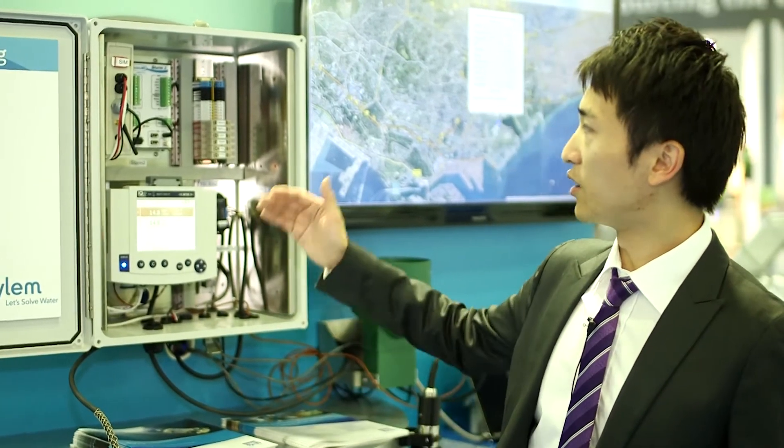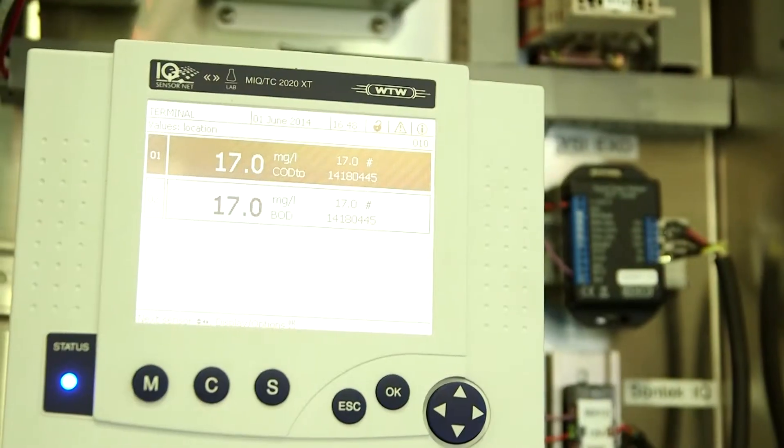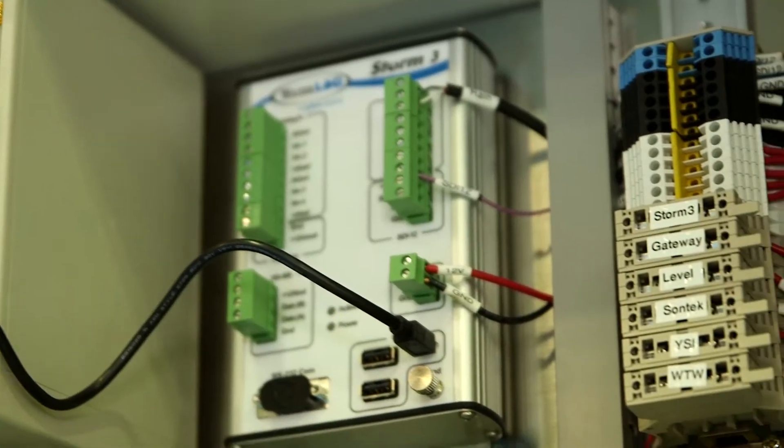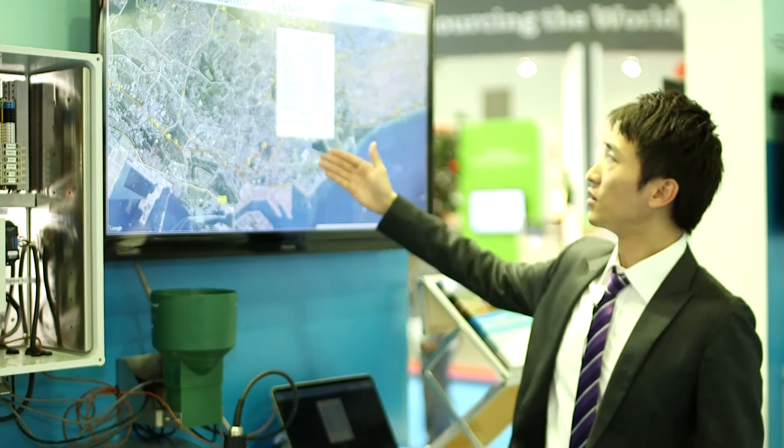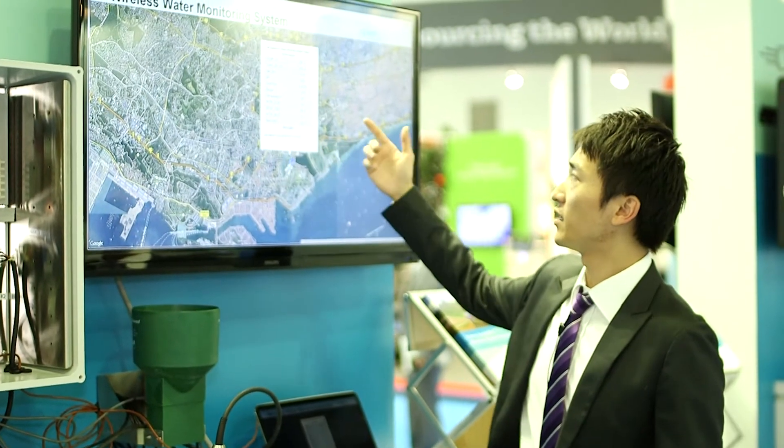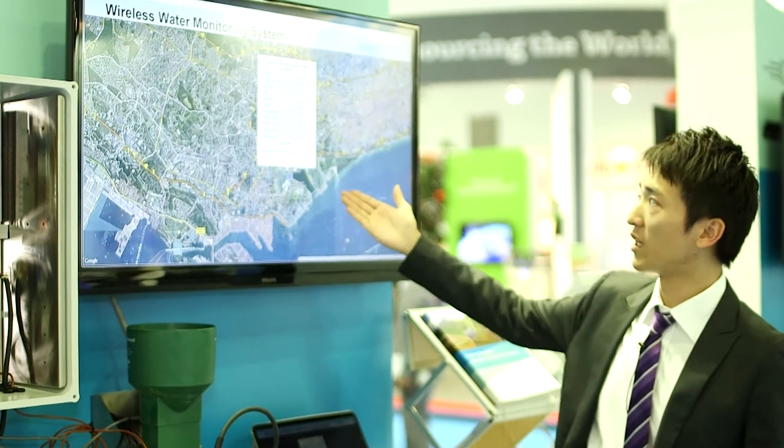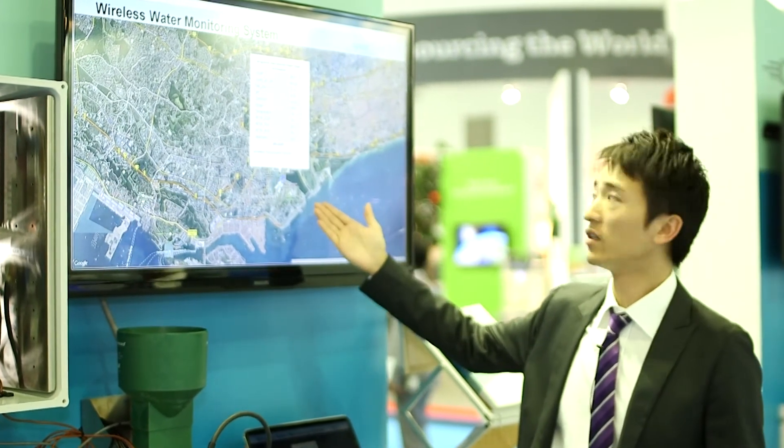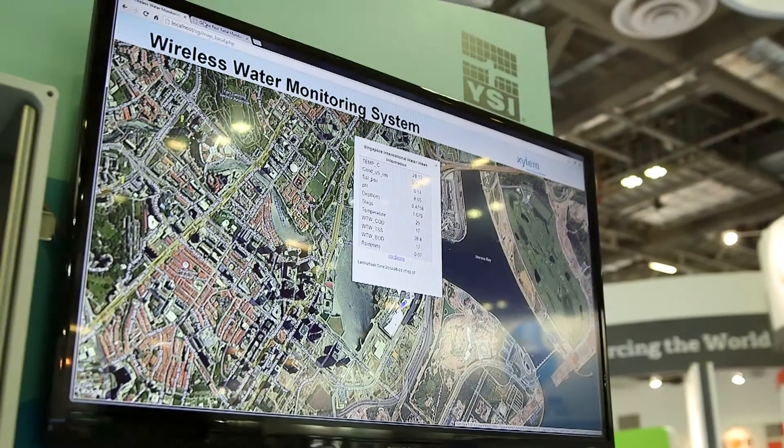So we collect the data from the sensor and then using the monitoring station to send the data back to a server where we can go into the website to see the data. And here you can, for example, you can see the pH level, temperature, and COD, BOD readings real time.